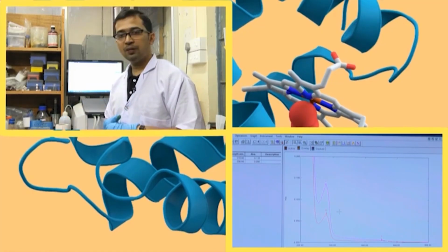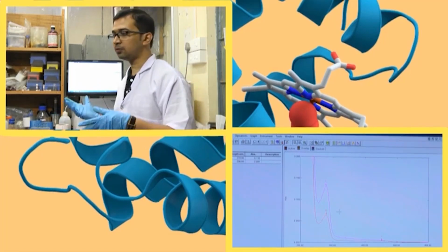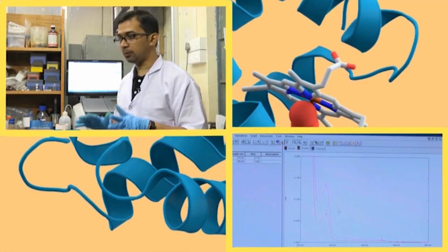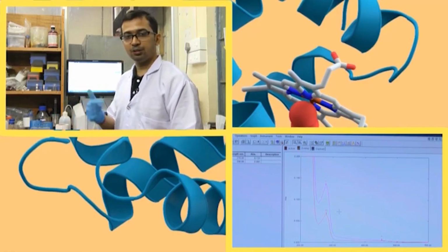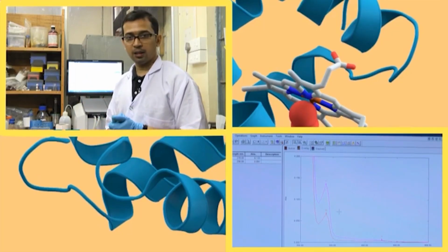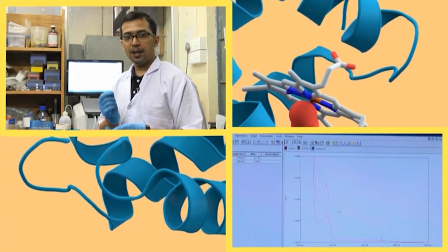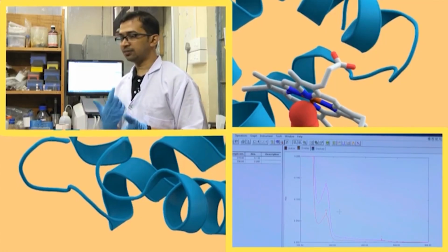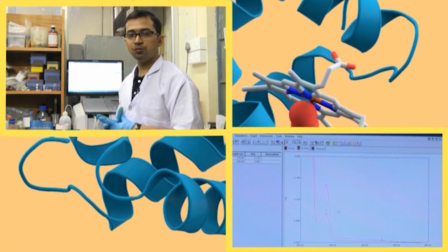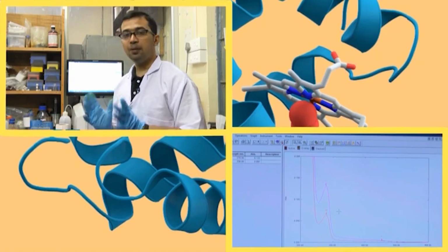You can proceed with this method if you feel like, or in some advanced UV machines there is a magnetic stirrer attached to it. You take a cuvette, and that is much more reliable and much more accurate. In the cuvette holder, as we can see here, there is a magnetic stirrer. Magnetic stirrers are common in the lab, but this one is at a micro scale. In the cuvette we put a small magnetic bit, generally known as a flea bit, in such a way that it does not break the cuvette, and just turn on the switch on this magnetic stirrer. It will rotate, stir continuously, and keep the system homogeneous throughout the reading.